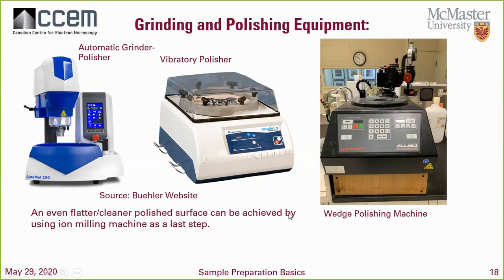Flatter, cleaner, right? The vibratory polisher, I think, is a huge tool. I would use a vibratory polisher after my final polishing steps, because let's say you're preparing samples for EBSD, you need a perfect surface, an almost perfect surface, okay? And in order to do that, we have to polish the sample very slowly, very calmly, and us humans, I don't think we can do that. So I think the vibratory machine here allows us to do that very, very well.